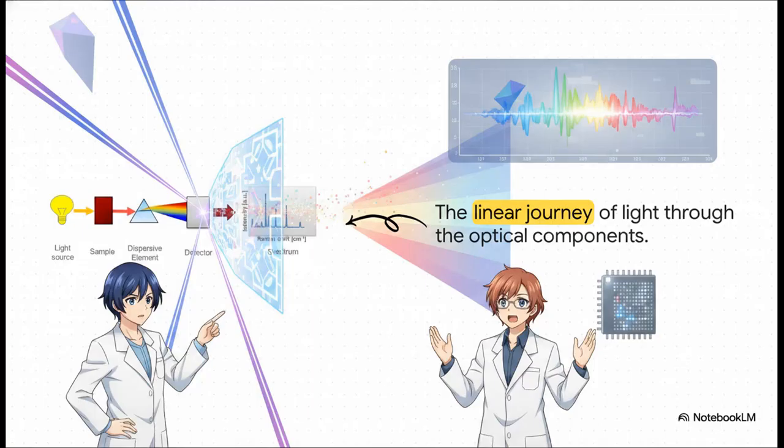Along this linear journey, the optical components and filters are literally the unsung heroes of the entire operation. Think back to that 1 in 10 million statistic. If we didn't filter out the blinding light of the elastic Rayleigh scattering, it would completely overwhelm and fry our detector. Specifically, holographic notch filters are used to block the main laser wavelength while letting those incredibly faint shifted Raman photons pass safely through to the dispersive element, like a prism or grating. That element separates them out so the CCD can read the unique spectrum.